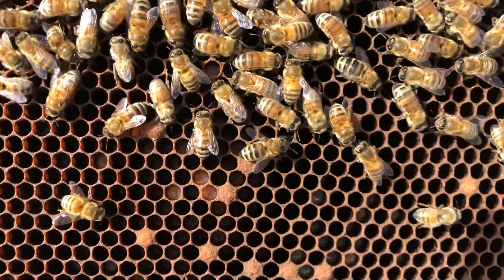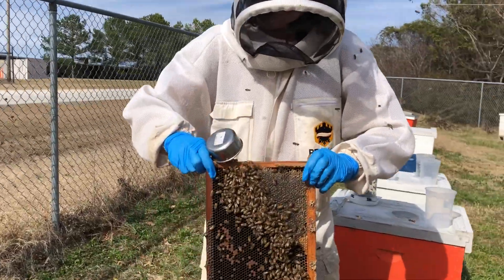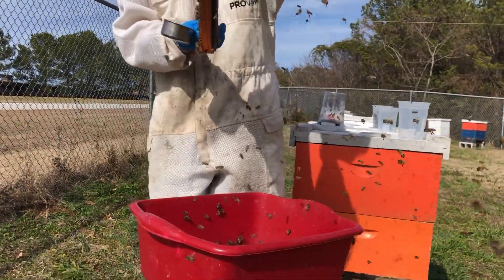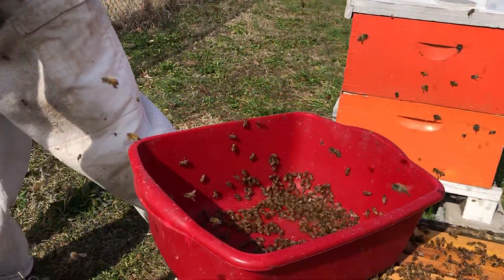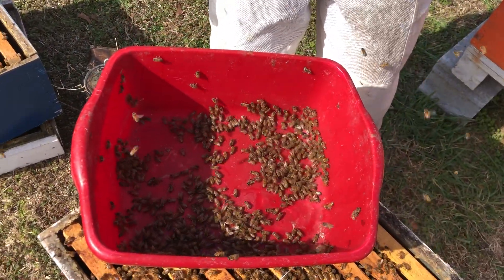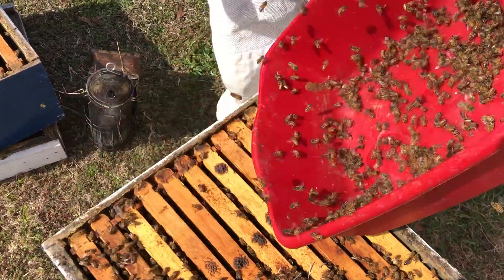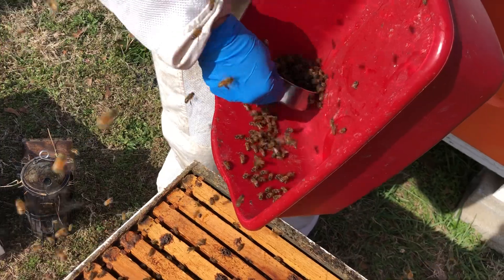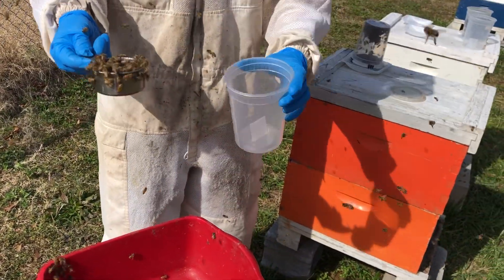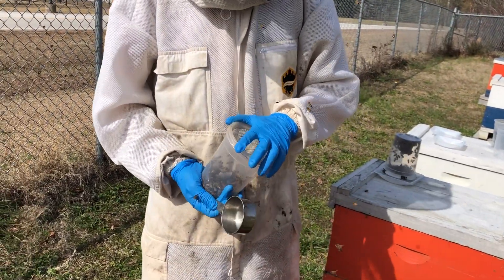Just like we do with an alcohol wash, we're going to take that frame — always double check for the queen, but I saw her on another frame already — and we're going to shake those bees out into our tub. We're going to wait 10 seconds to allow the foragers to fly off, and then we're going to shake down and take a half-cup scoop of bees, or roughly around 300 bees. We're then going to put them into our cup that we've made with our Apivar strip at the bottom.